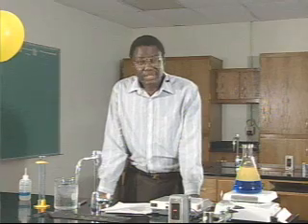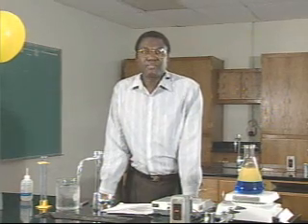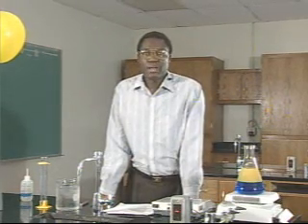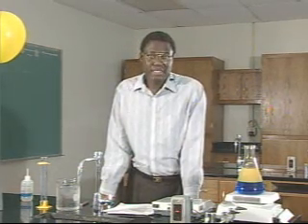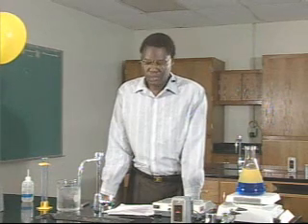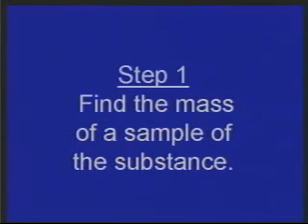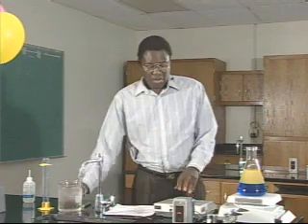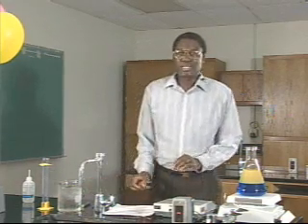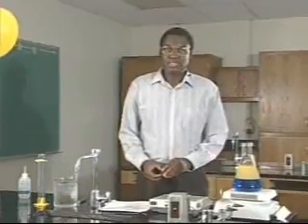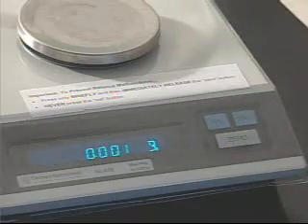To measure density, you need two things: the mass and the volume. We use a scale or a balance to obtain the mass. So you are going to see how to obtain the mass using the balance in front of you.